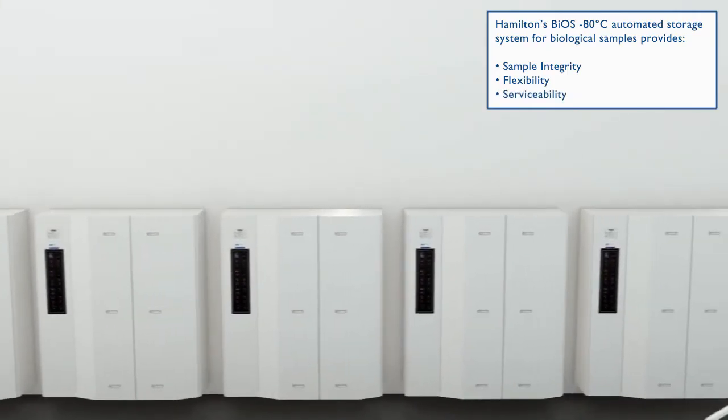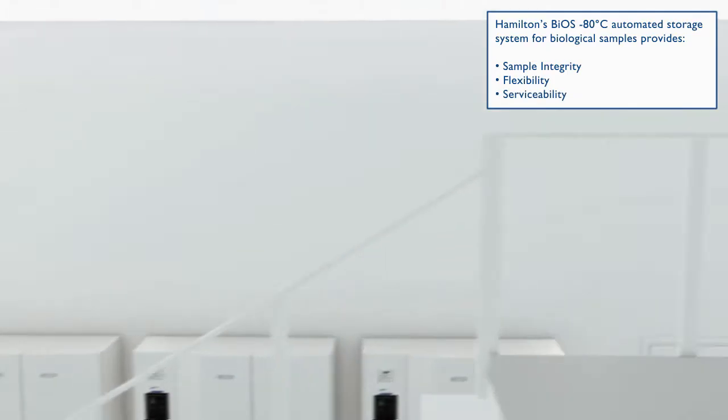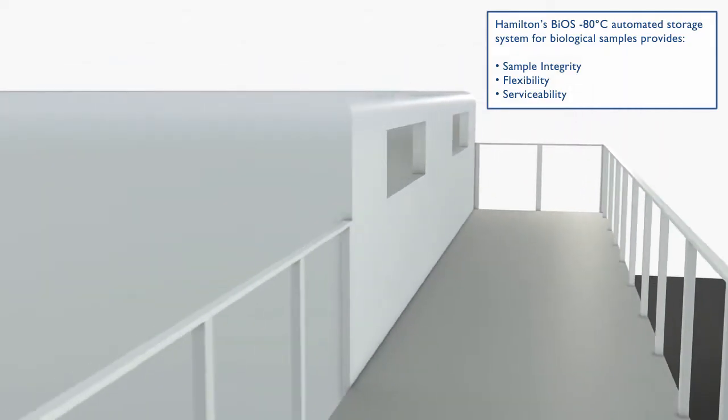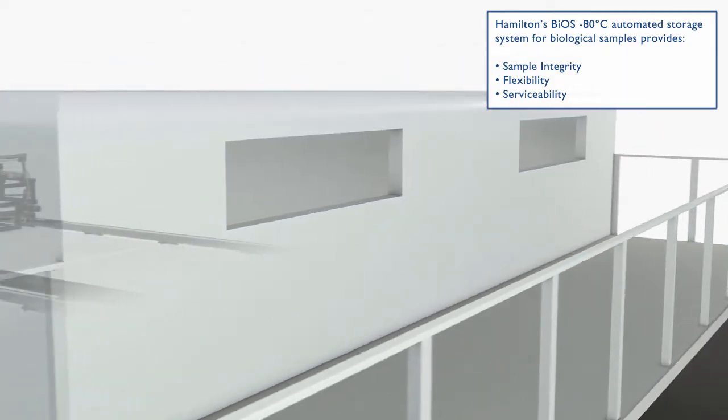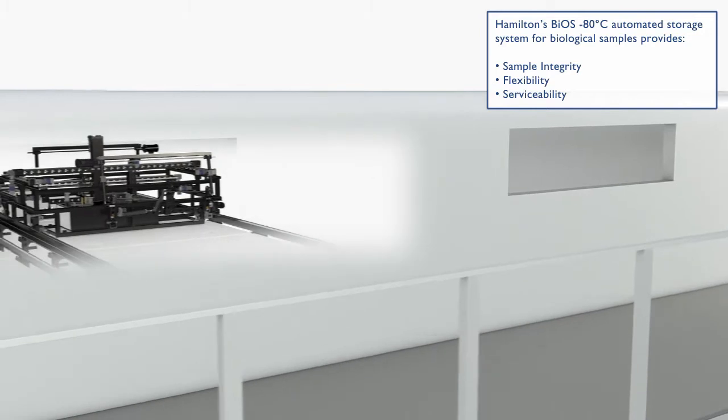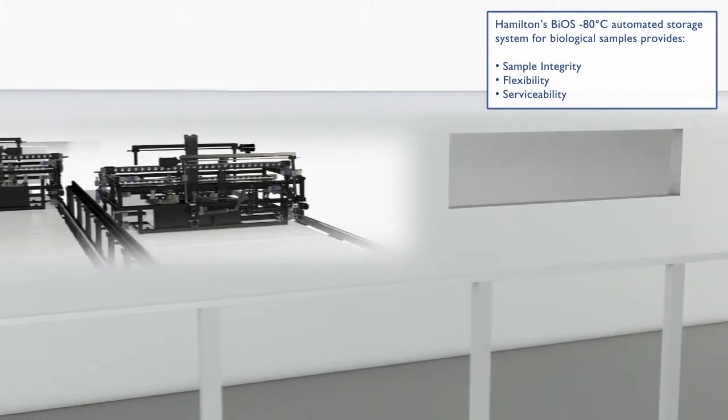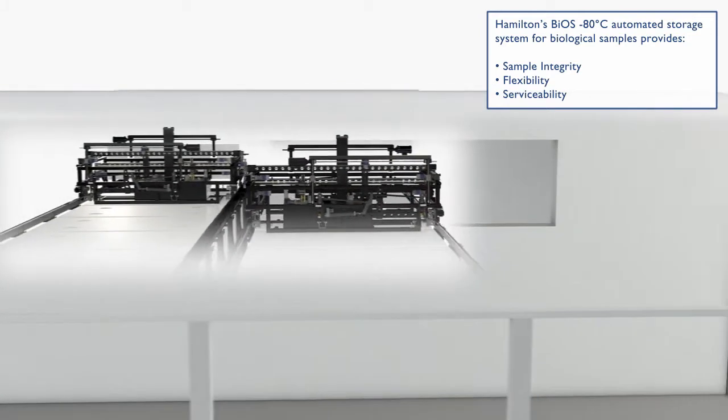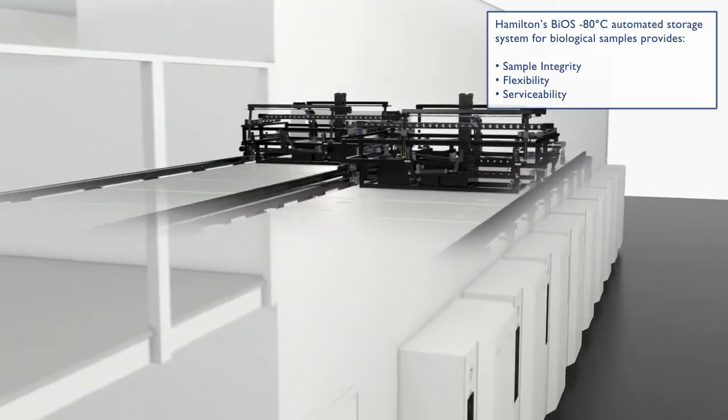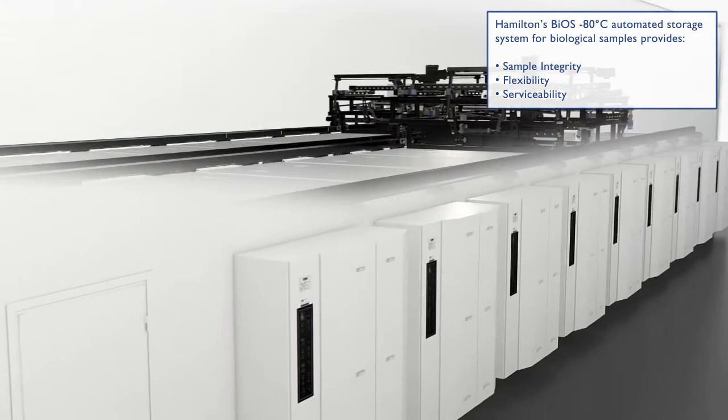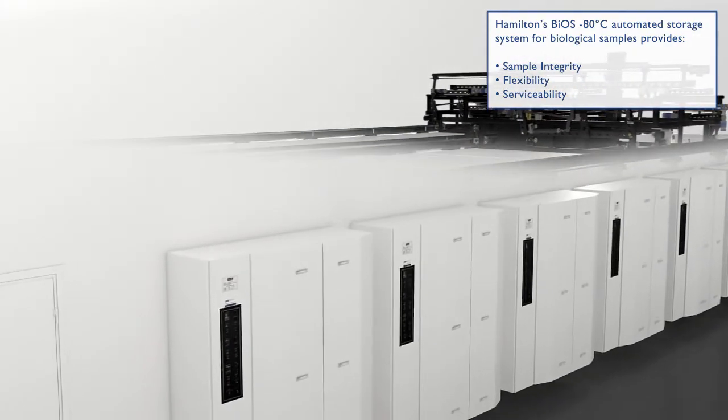BIOS protects biological samples by providing unparalleled temperature stability. BIOS provides outstanding flexibility in terms of scalability, field upgradability, and usage of all kinds of tubes and plates. BIOS is designed for easy servicing while keeping your samples safe.